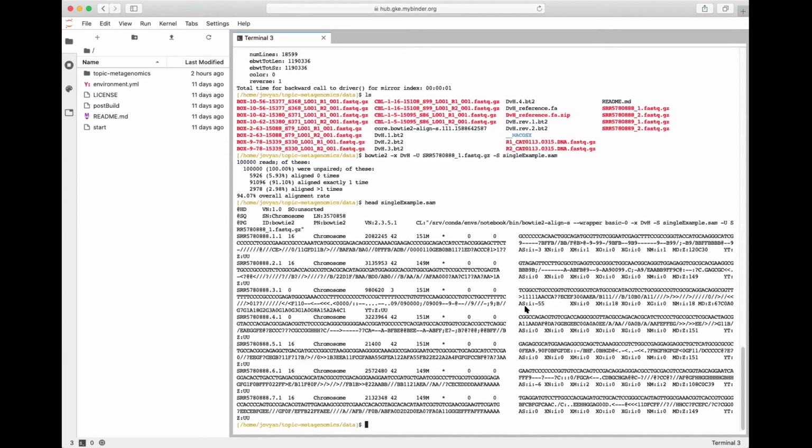Awesome. All right. So this was mapping just one single read. Let's see how we map paired reads. So I'm going to do the same thing. Bowtie 2, give it the same index, but this time I'm going to tell it -1 is the forward read. So let's say we use this sample and then give the matching reverse read. So I'm just going to change this to 2 with the -2 flag.